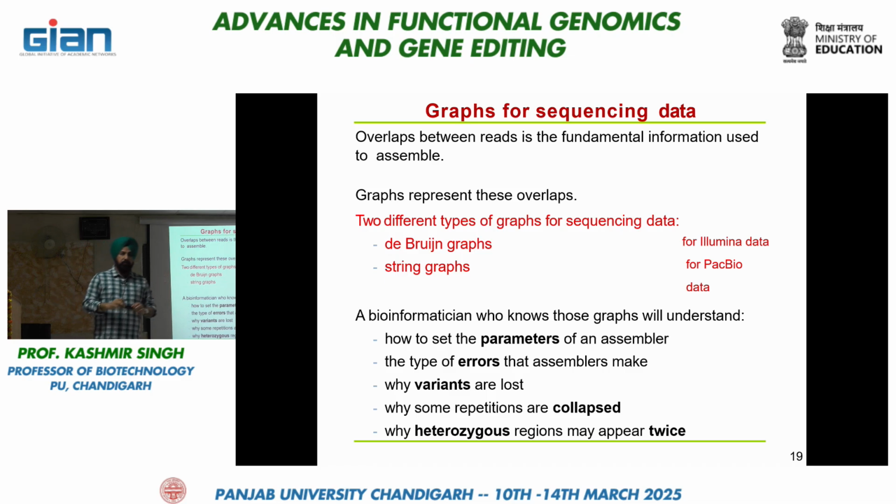Now there is a problem. Suppose as a human being you want to create longer contigs, so you will overlap the sequence like this, with a minimum amount of bases overlapping. It will generate large contigs, but there may be a possibility that some k-mer that has nothing to do with it gets joined with you, because you have given a very low overlapping value, and 4-5 bases by chance matched each other, and then they start making contigs.